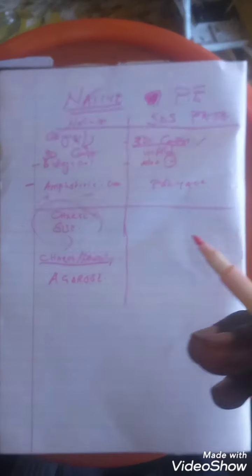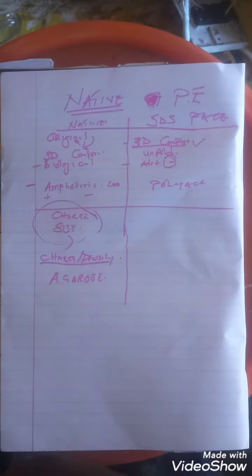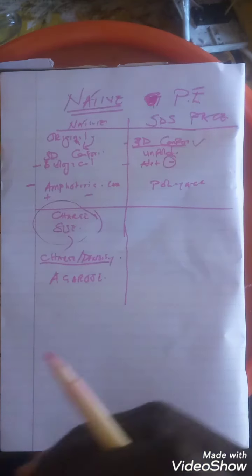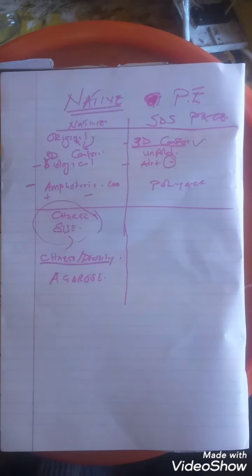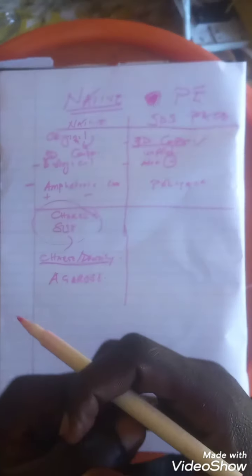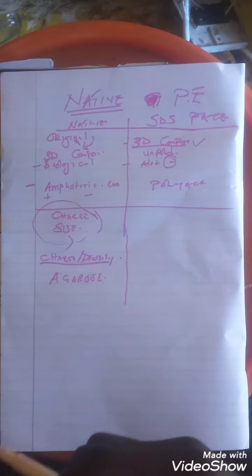Then the resolution will be slightly difficult. We will have difficulties in acquiring a full separation or effectively separated molecules. Why? Because due to the large pore size of agarose, almost each and every molecule which differs in size, either large or small, will just pass through the pores. And again, if they have the same charge density, then it will be hard to separate such molecules.